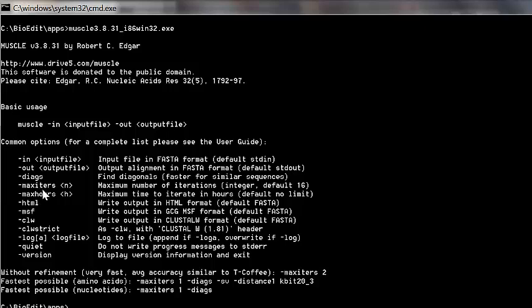Beyond -in and -out, MUSCLE has other options: '-diags' makes it faster for similar sequences by finding diagonals; '-maxiters' sets the number of iterations (default is 16 maximum, but it stops early if alignment is found); you can limit runtime for complex datasets; and adding the flag '-clw' produces output in ClustalW format instead of the default FASTA format.